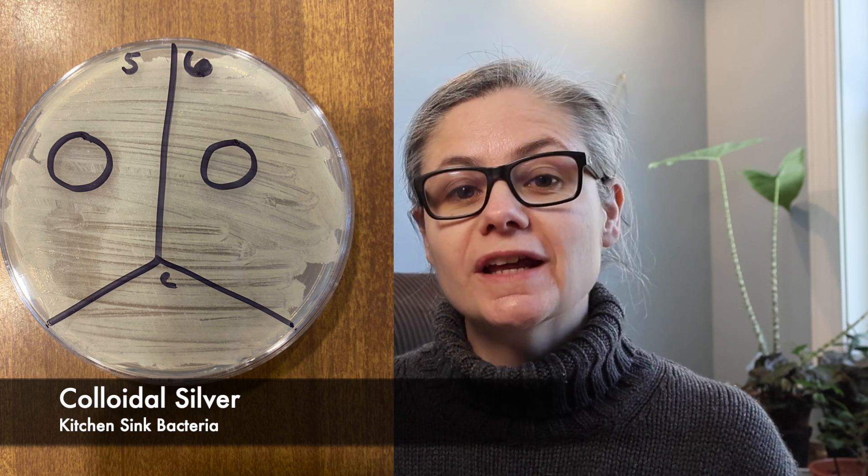Moving on to colloidal silver, let's look at the kitchen sink bacteria. Section five has the full-strength drop of colloidal silver. The drop was very runny and it did move on the petri dish — the grapefruit seed extracts are very thick and viscous, so they didn't move, but the colloidal silver did because it's very liquidy. We can actually see where the drop rolled because there is less bacteria growing in that area. It's not as visible as the full-strength grapefruit seed extract, but we can see an outline where the colloidal silver was. In section six, the diluted colloidal silver, I'm not seeing any differences at all.